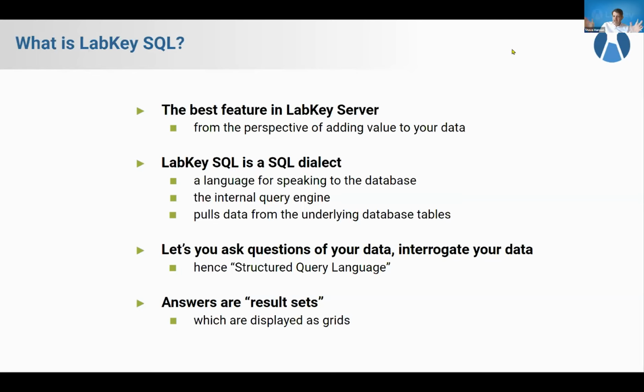And then once I write that out in English, actually, every time I code, I write it out in English, even JavaScript. I'll start with just a series of comments and write out in English what I'm trying to do. Same thing with SQL. The beauty of SQL is that it's also one of the easiest languages. If you've never done any coding at all, I really recommend SQL as a great starting point, because you can, first of all, start in English very effectively, and then your translation into the actual syntax of SQL is fairly easy, relatively easy.